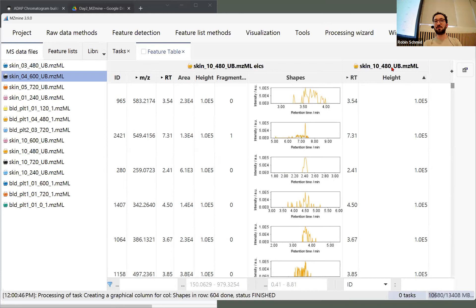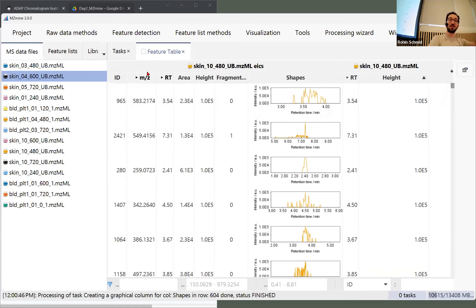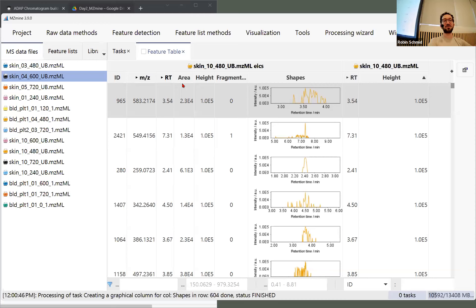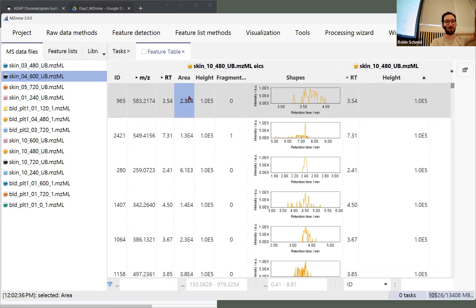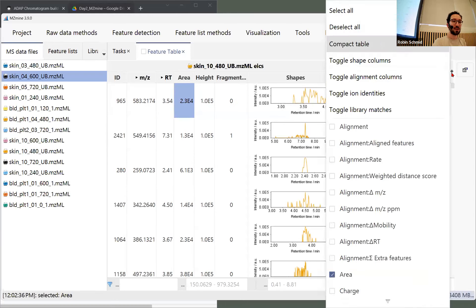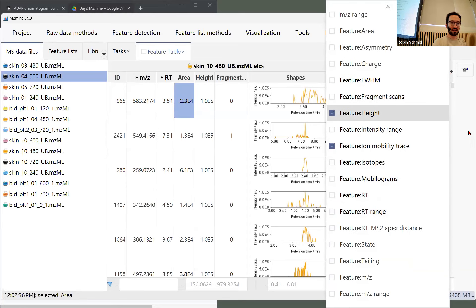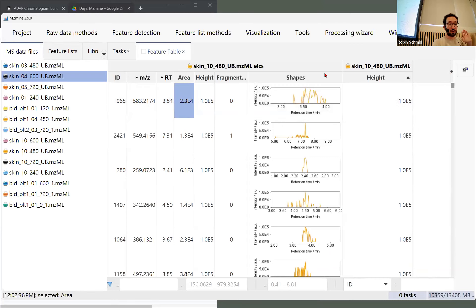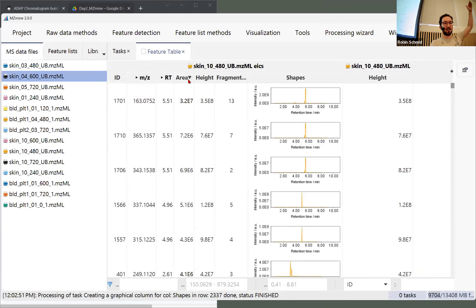If I add feature retention time, it opens up the retention time on a sample level. So if we later have multiple samples in the feature list, we can see the retention time shifting between samples. On the left side there's the average retention time, average m/z, maximum area, maximum height. You need to know how we collapse those samples — I'm just going to remove that column.